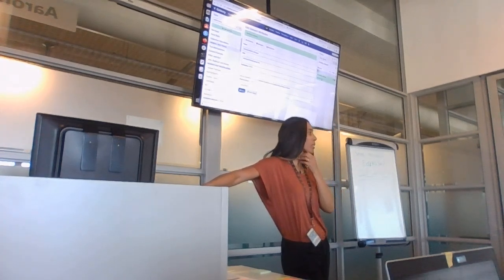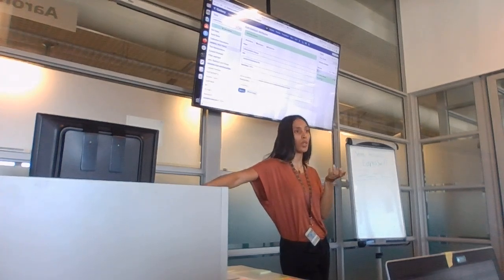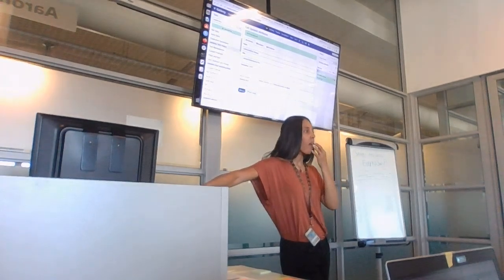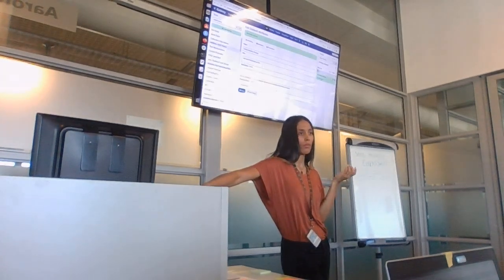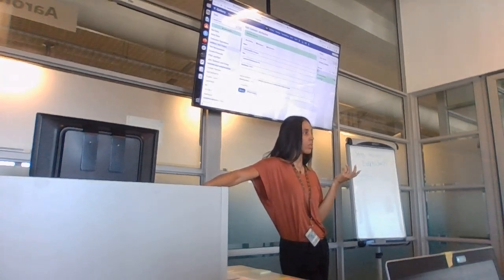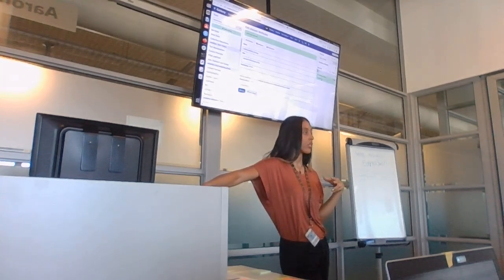An analysis with multiple steps. Okay, so there must at least be 2 tools that you're using or 2 steps that you're making. In what case would you want a workflow? If you're going to use this once, no. So you would create a workflow if you know this is something that you do often, right?